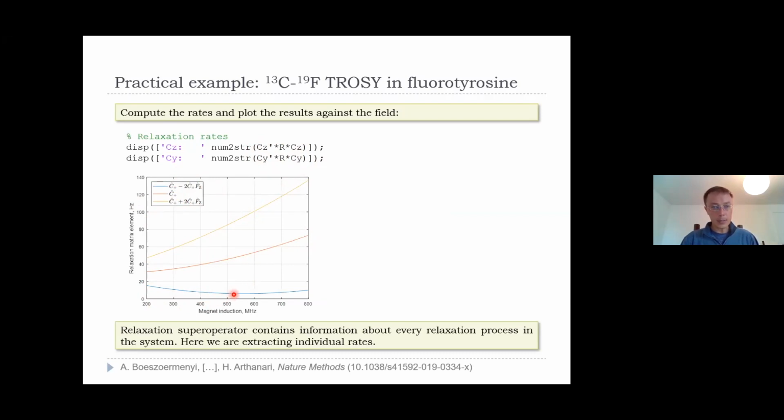Think about it, this is 25 nanoseconds, so a large protein. This is fluorine. Normally, if you were doing straight aromatic fluorine spectroscopy, the line width would be in the kilohertz. And this is less than 10 hertz. So I don't know how Hore came up with this idea. It was a brilliant idea. And so then, after a couple of days of calculations, we see exactly what's happening there.